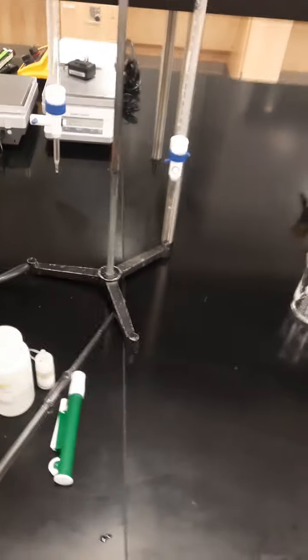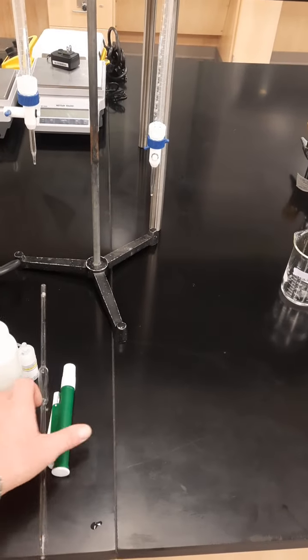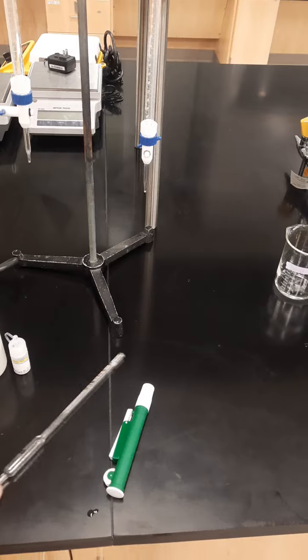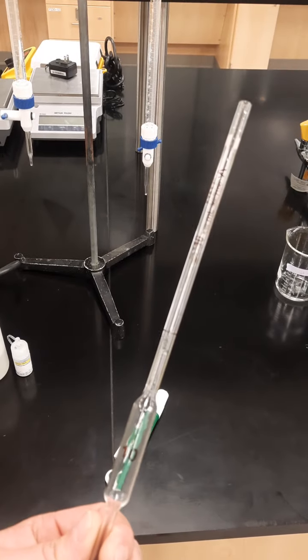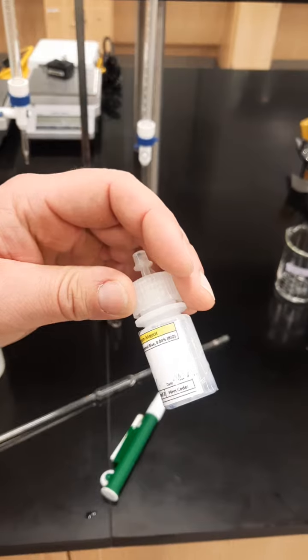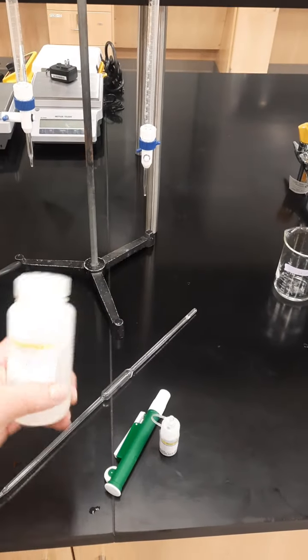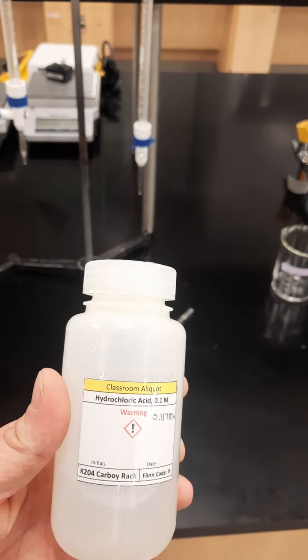These are things you need from the cart: you need to get a pipetter, a 10 milliliter pipette, a dropper bottle of bromothymol blue, and the hydrochloric acid solution.